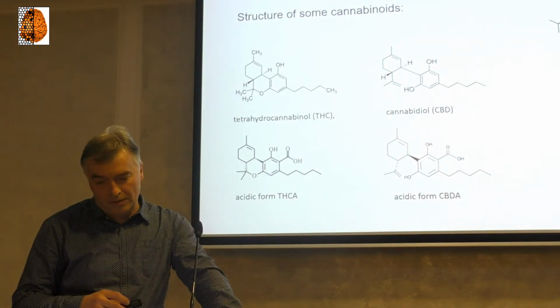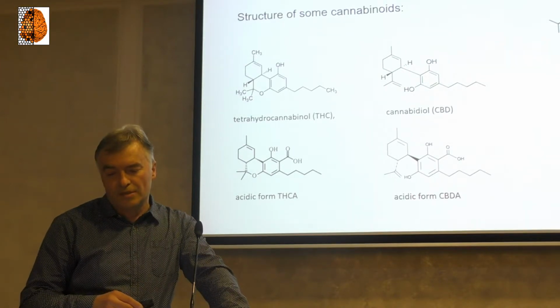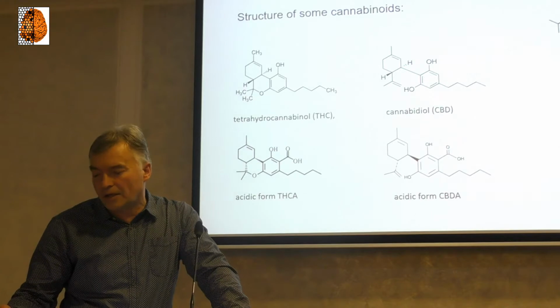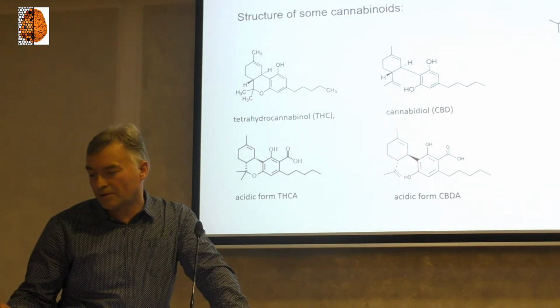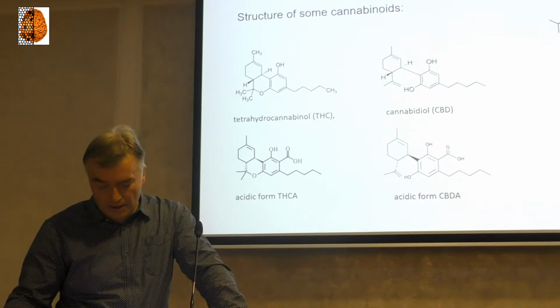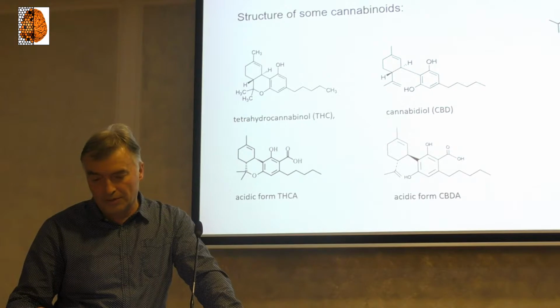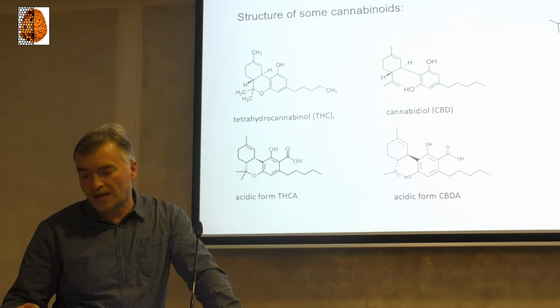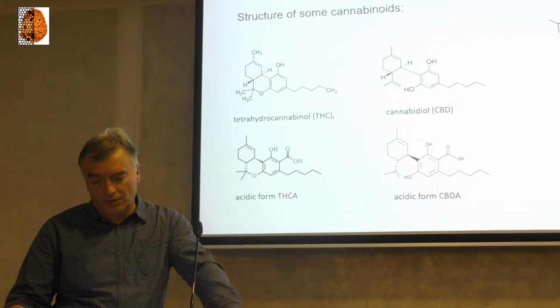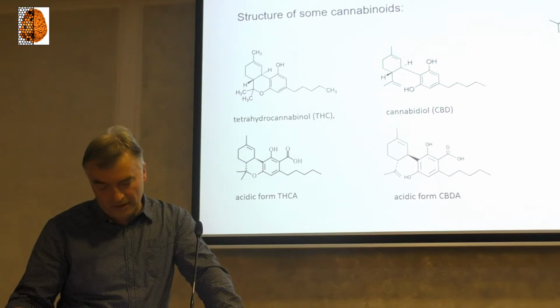In the case of chemical analysis of these compounds, we use two techniques: gas chromatography mass spectrometry, and liquid chromatography mass spectrometry. Both are somehow exclusive, but some points of these techniques are the same, and the results are usually the complete form of using both techniques.